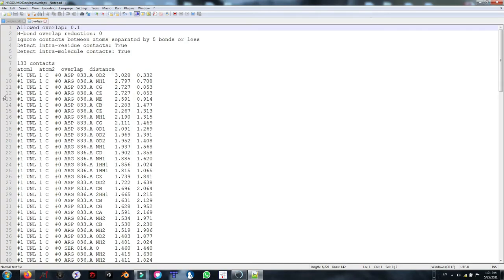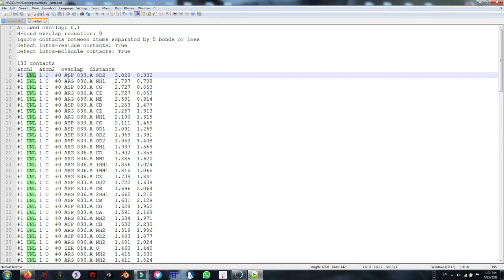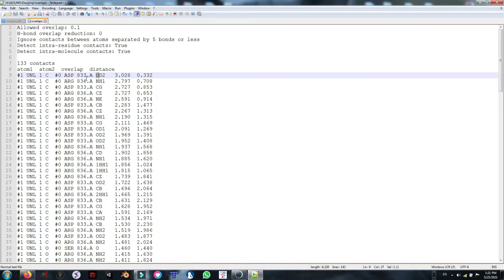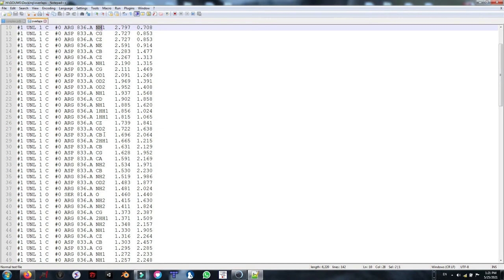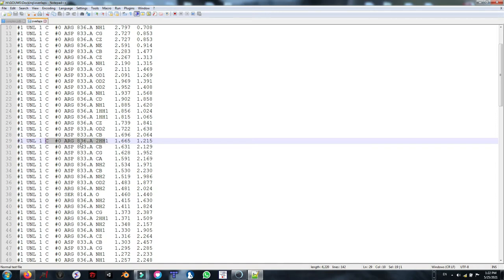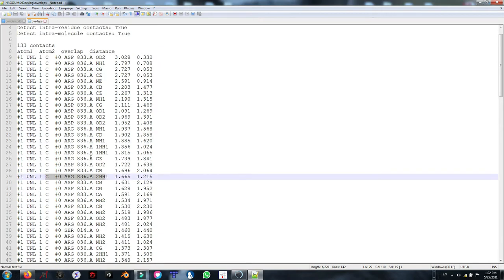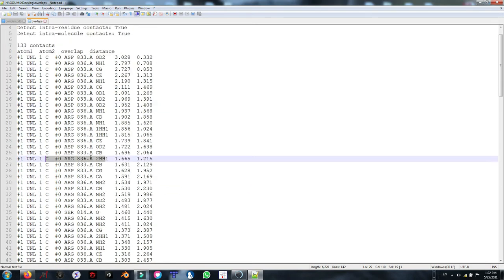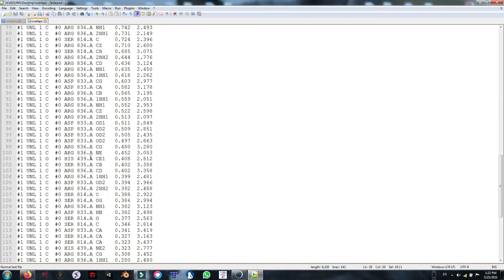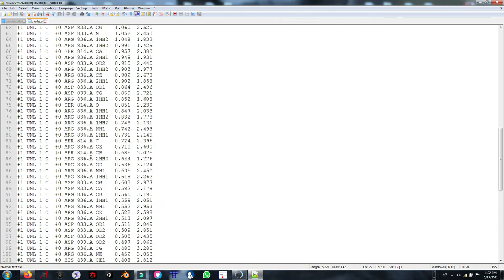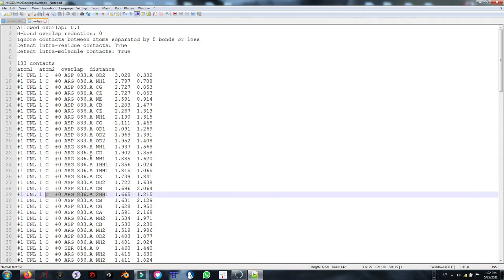As you can see, the atom 1 and atom 2 define both ligands and our protein. And you can see the atoms involving the interaction with carbon 1 in our ligand with oxygen group number 2 of aspartic acid, or carbon number 1 with arginine amino group. Otherwise, hydrogens may provide us a hydrogen bond like what we see here in our arginine 836 at the distance of 1.2 angstrom. This file can be used for writing down our results.